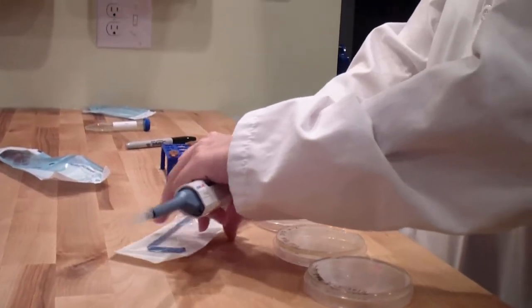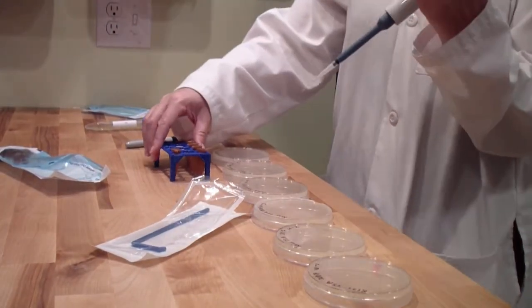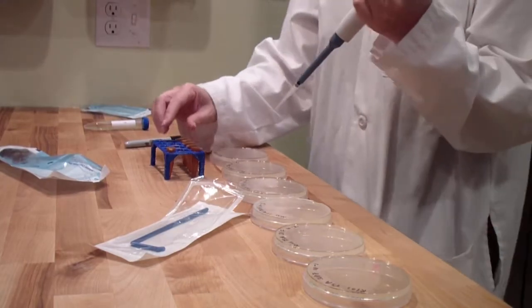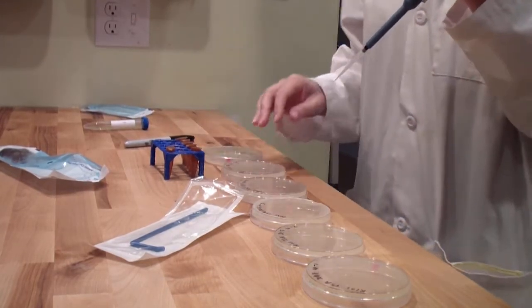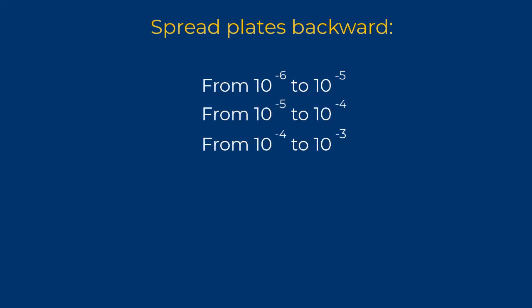Once you have completed the serial dilution, you are ready to transfer the liquid to the matching plates. From now, you will work starting from the most dilute, which is the ten to the negative six, backward to the least dilute, which is ten to the negative one. That way you can use the same tip and spreader as you work.